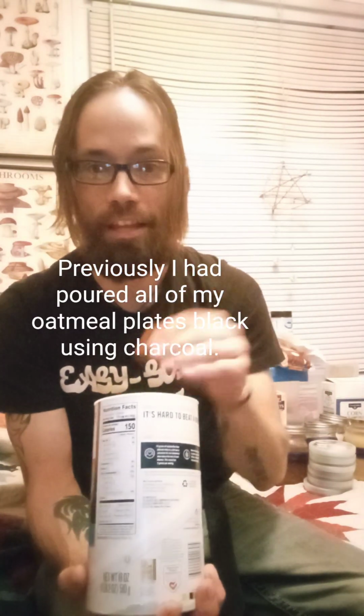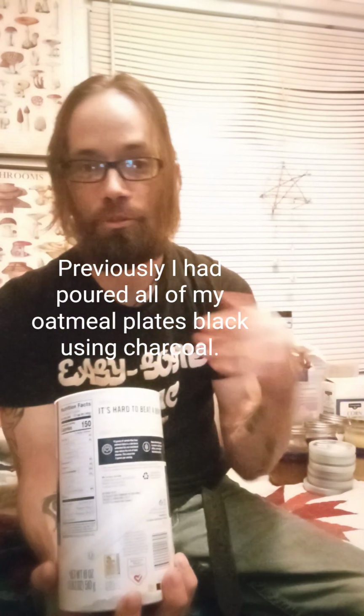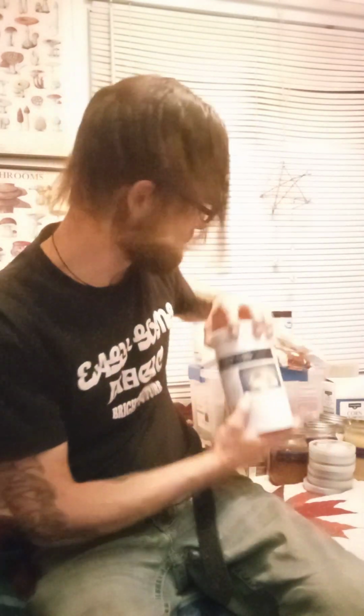Well, I didn't realize that they were going to change the color of everything. All of the media, after it cooked, came out forest green. All of it. The purple, the sky blue, I don't know why. It just does that. And then I can take any other nutrition source I have, color the plates, cook, pour, and they're the right color. What it is that seems to turn them green, I don't know. Maybe it's my food coloring. Maybe I need to go to gel food coloring or powdered food coloring for this anyway. But yeah, that's just a little note, something to think about.